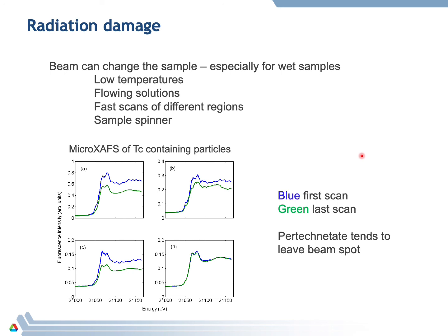It's always good to look out for radiation damage by measuring multiple scans, and maybe not measuring one really long scan, but measuring several shorter scans.